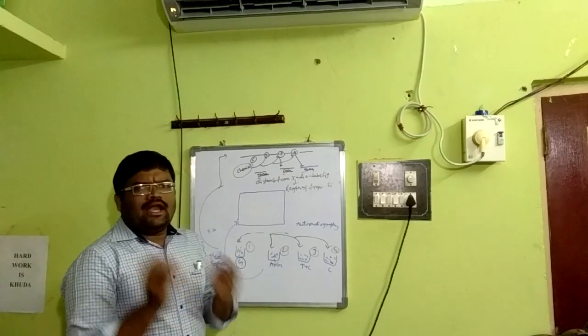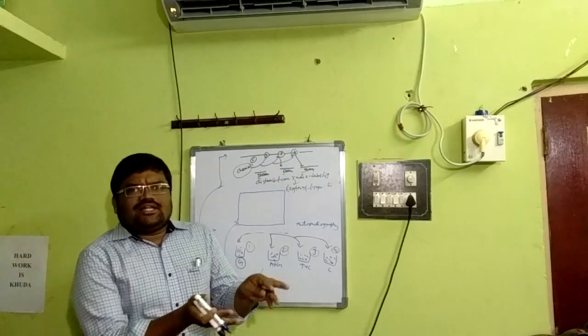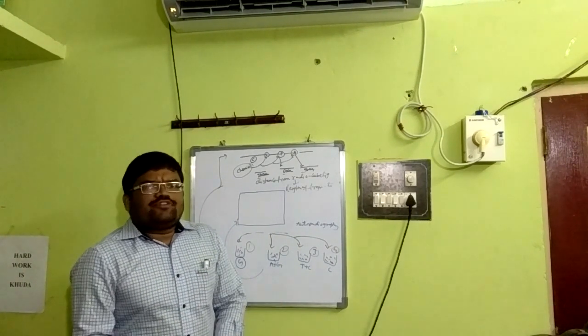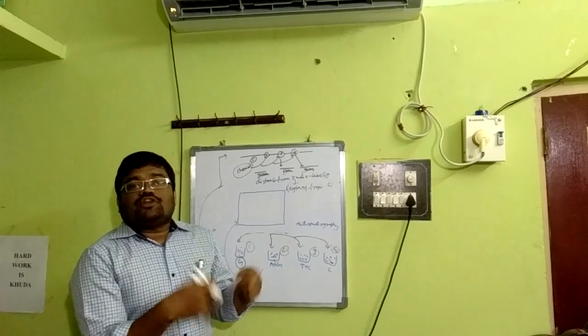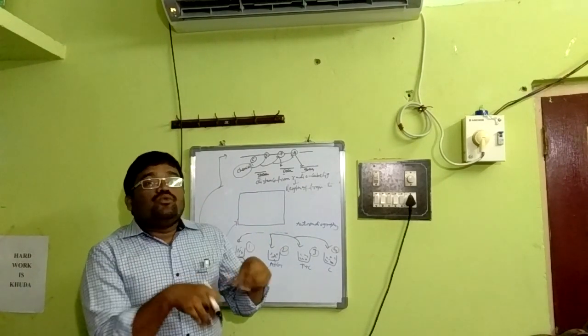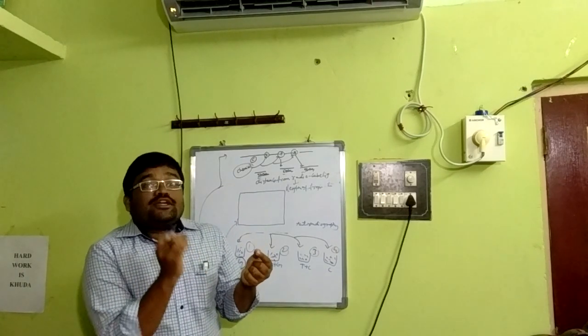It's a usual procedure. You have to run the gel, either agarose or polyacrylamide. Polyacrylamide is more accurate than agarose gel. Then you develop the electrophoretic plates, and with the help of autoradiography, that means through autoradiographs, we identify the DNA sequence determination.